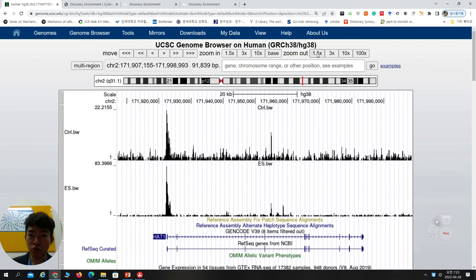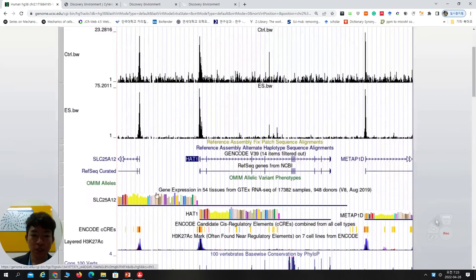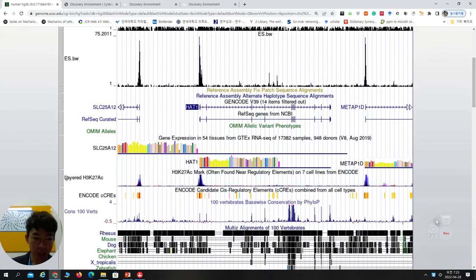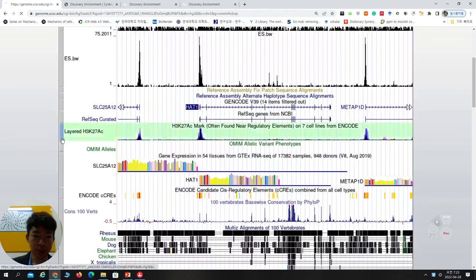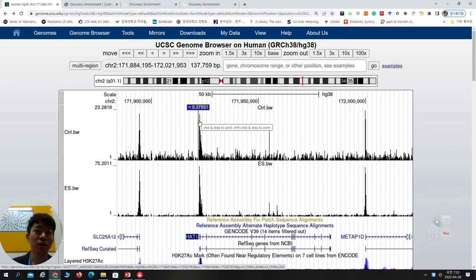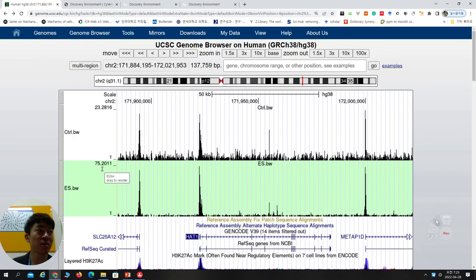This is the HAT gene. If you want to zoom out more, do it one more time and you can see other genes. This is the reference. Most of the time, I use H3K27 acetylation — you can move it here and change the value. Here it looks like the control and ES are very similar, but actually they are not. Control maximum is 23, ES maximum is 75. That's why you have to change the track height to match. Set the ES group's track height to 75 as well.